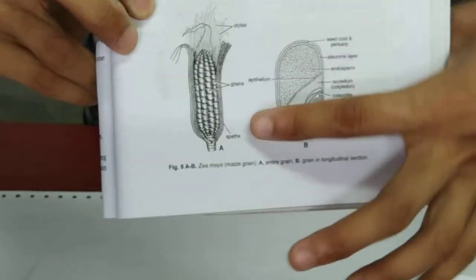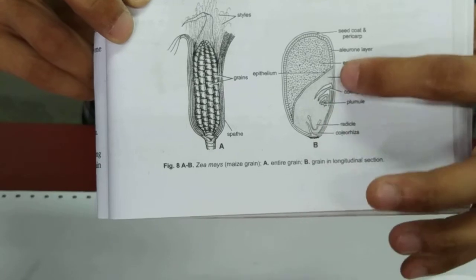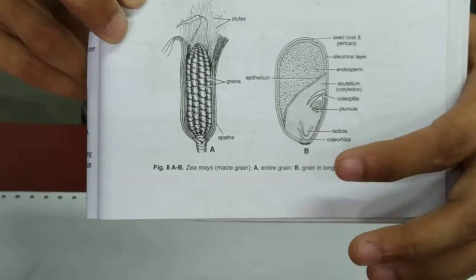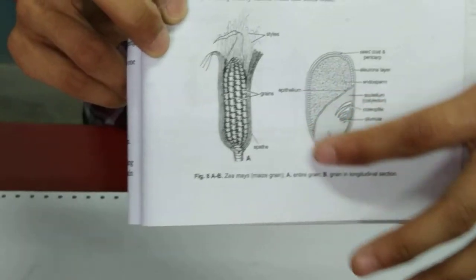So under a microscope this is what you are supposed to see. I have already shown you the plumule and the radicle. These two portions over here which can slightly be observed. Look under the microscope more clearly, you can see this entire structure.